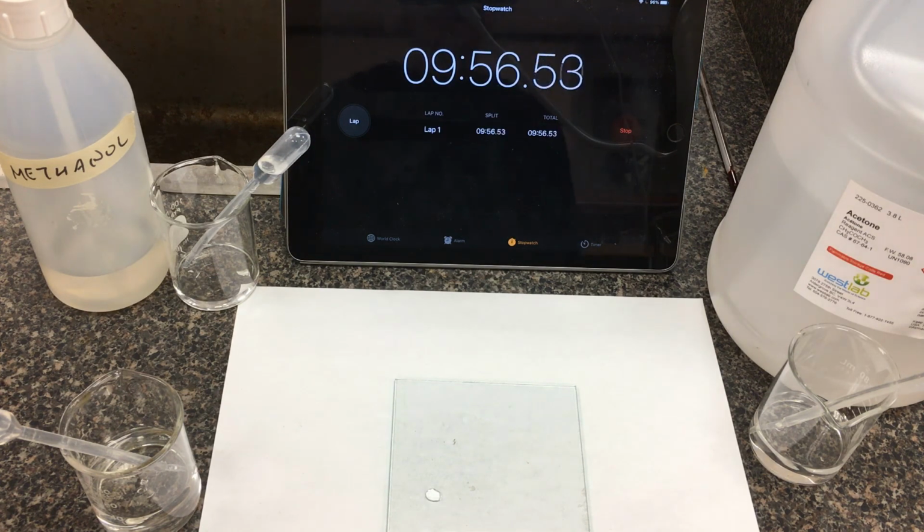All right, so we're going to end it off there. You can stand around for a lot longer. We can just say more than 10 minutes for this water solution. Perhaps the methanol solution actually had traces of water left over in the beaker. Maybe that's actually water. That could be a reason why those two last little droplets are still hanging on there. Okay, but at least you get a qualitative comparison between these solutions. Thanks, guys.